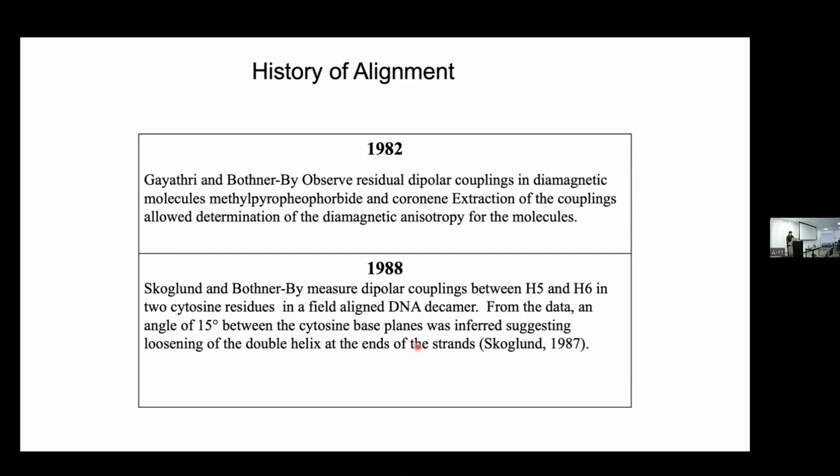Could be. And so by the way, if we think about how magnetic alignment scales with the magnetic field, let me ask that question. If I double the magnetic field, how much more aligned is my sample, which has magnetic anisotropy? Does it just double?